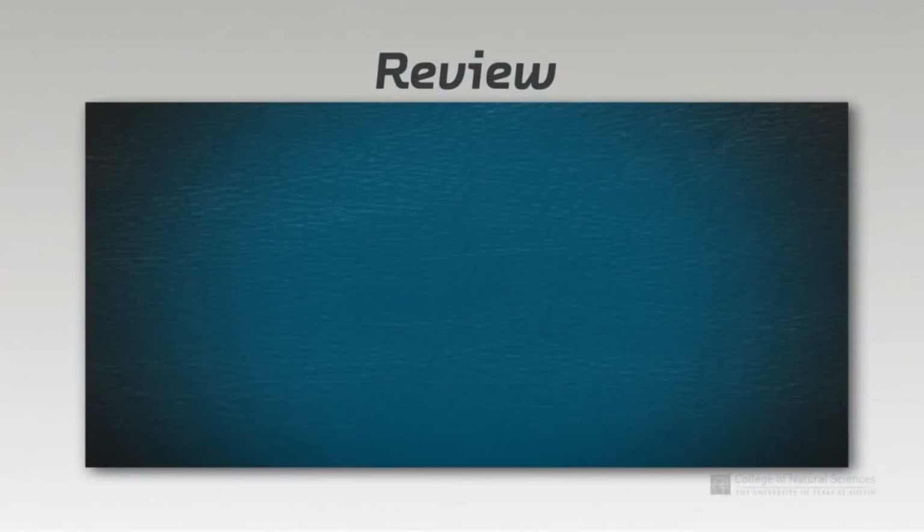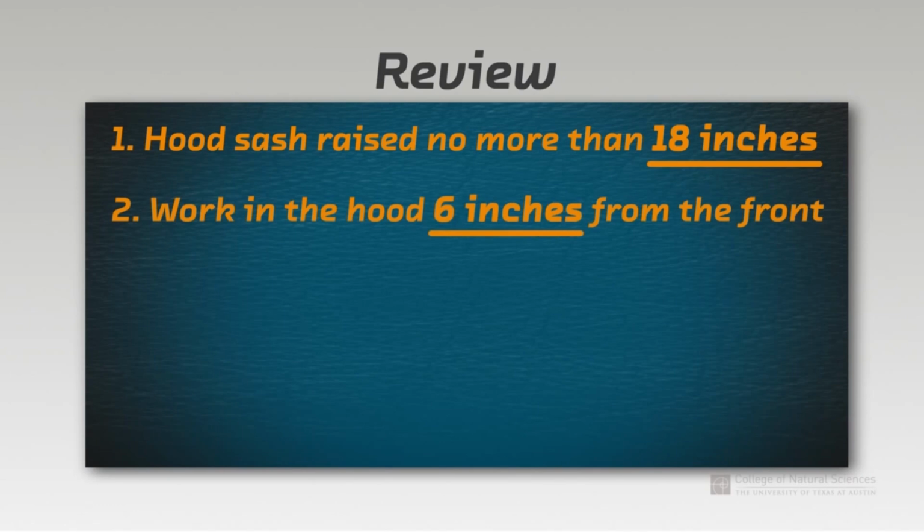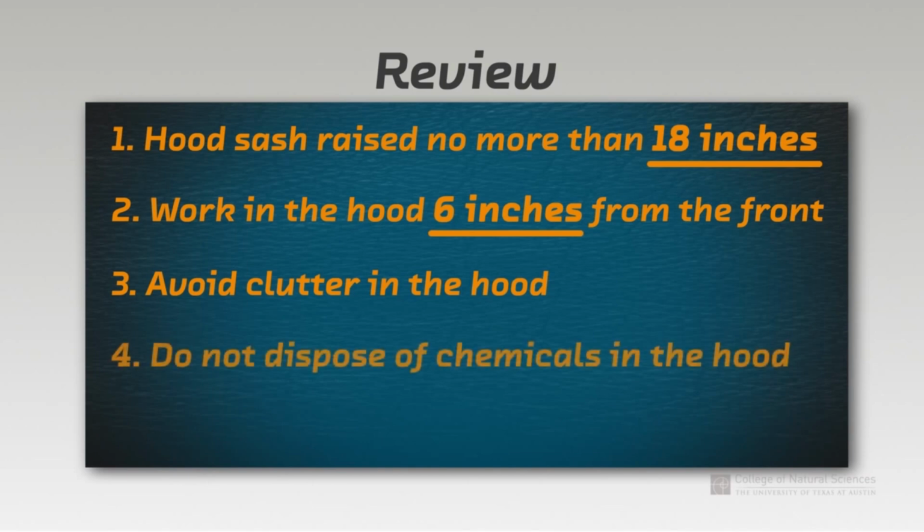To review, remember these guidelines when working in a fume hood. Remember to raise the sash no more than 18 inches for your safety and to conserve energy. Work 6 inches inside of the hood to ensure that you are not exposed to vapors. Avoid clutter in the hood, including chemical bottles. Do not dispose of chemicals either by evaporation or by pouring down the sinks at the back of the hood. Raise any large equipment that is stored in the hood.